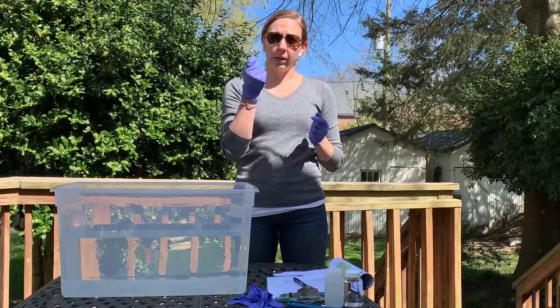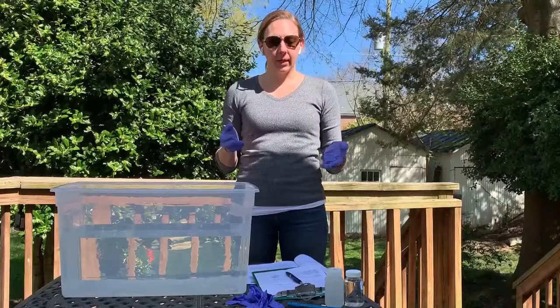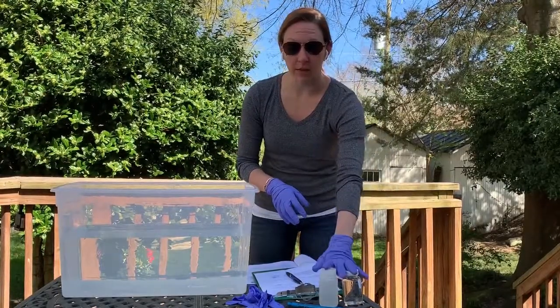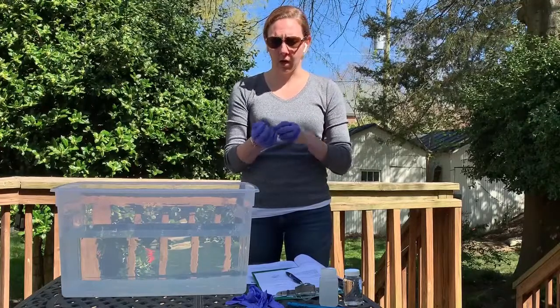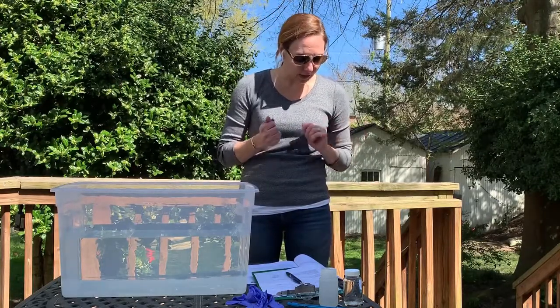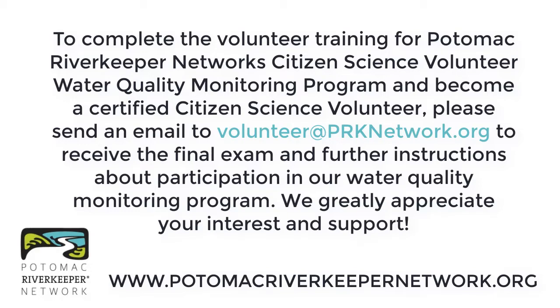Make sure you don't litter — once the test strips are used, dispose of them along with the container and the plastic wrap from the bacteria container. Once you're done taking your field samples, double check that your lab sample lids are securely tightened and labeled correctly. Verify it's the accurate site you just collected from, and make sure samples are in your cooler with ice. Take your gloves off so you don't contaminate anything else, and dispose of them properly. Then pack everything back into your kit and take it to the Potomac Riverkeeper lab to drop off the lab samples and supplies.